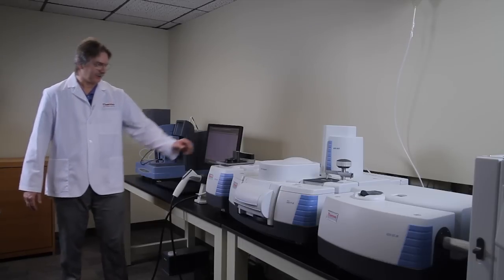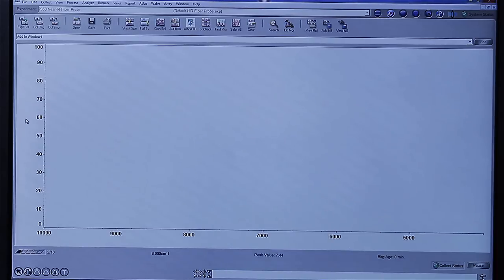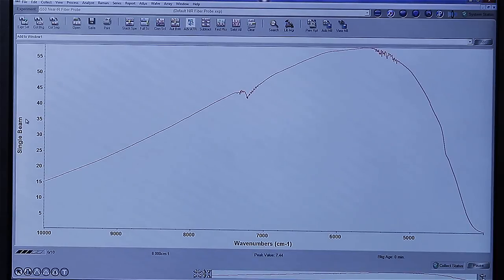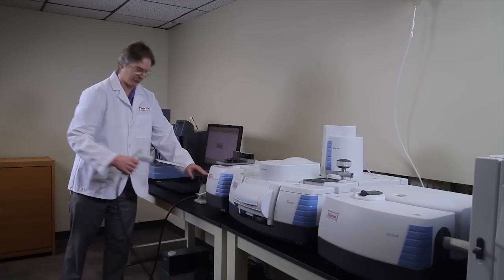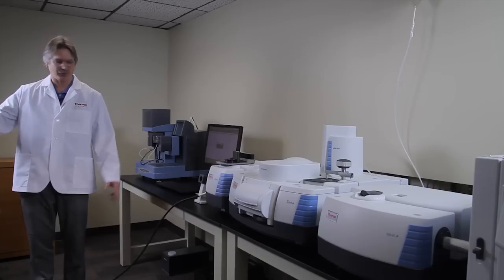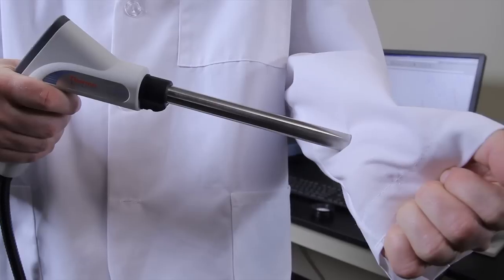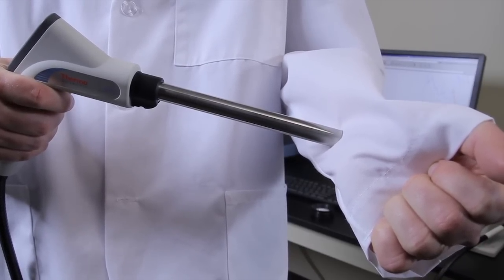All we have to do once again is just push the button to collect a background spectrum. Once the background is collected, we can then take the probe out of the sleeve and go anywhere with it within three meters of our cable and collect data remotely. Right now, I'll just collect spectra from my sleeve on my jacket.